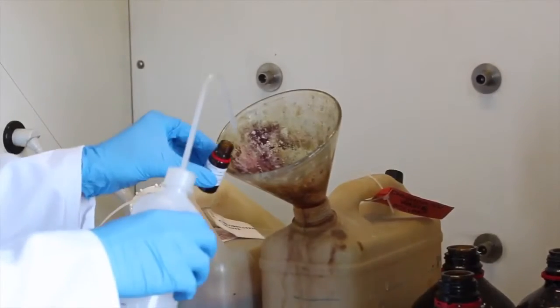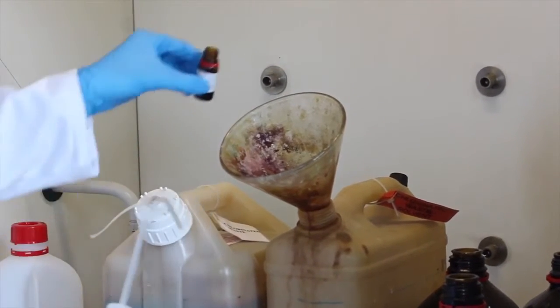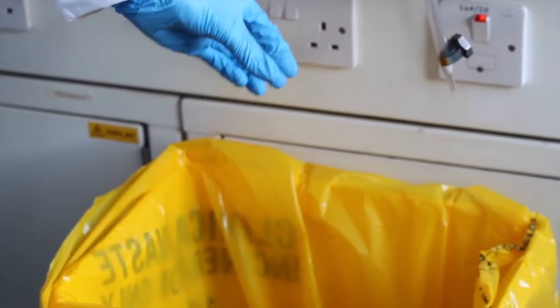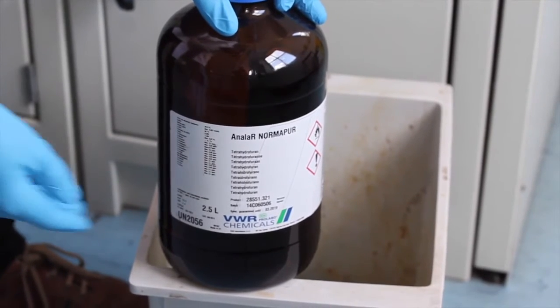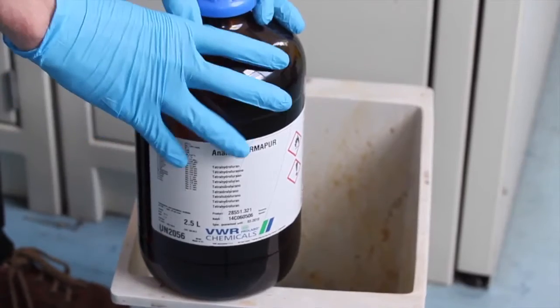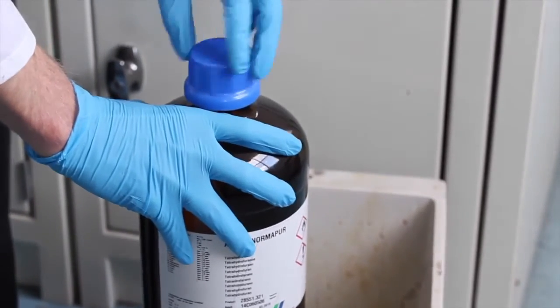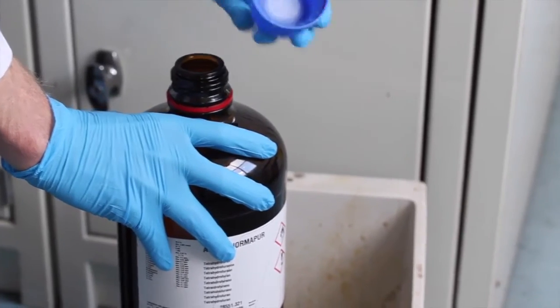If you need to dispose of a vial, for example, containing a solution, detach the cap from the vial, throw it into the general waste, dispose of the liquid properly, and then throw it into the glass bin. Similarly, if you need to dispose of a solvent bottle, dispose of the plastic cap in the bin and leave the bottle under a fume hood for at least 1 hour so that the residual solvent evaporates. Then you can dispose of the bottle by using the glassware bin.